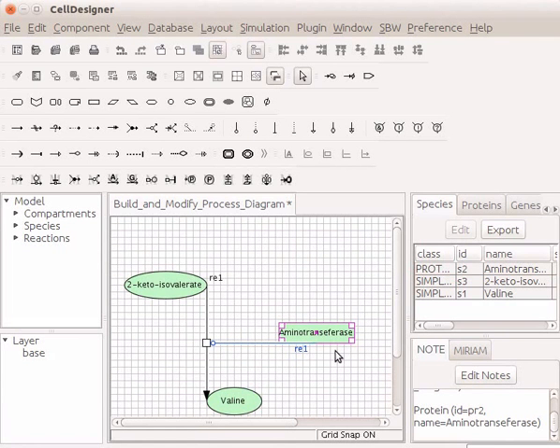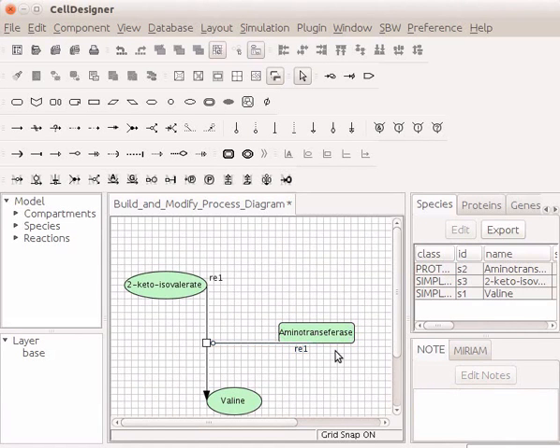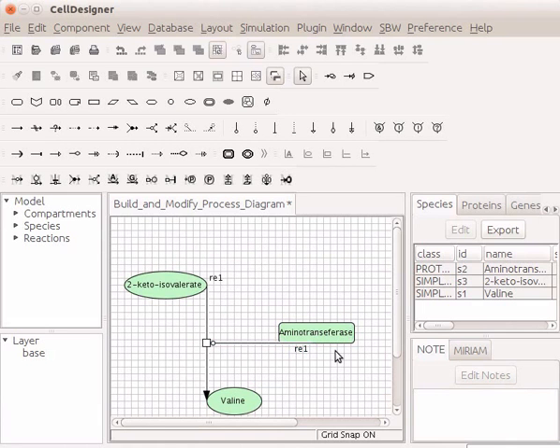We will now learn how to connect a reaction line around a species. A reaction line can be connected to any of the 16 connection points around a species. I will show you how to do so.